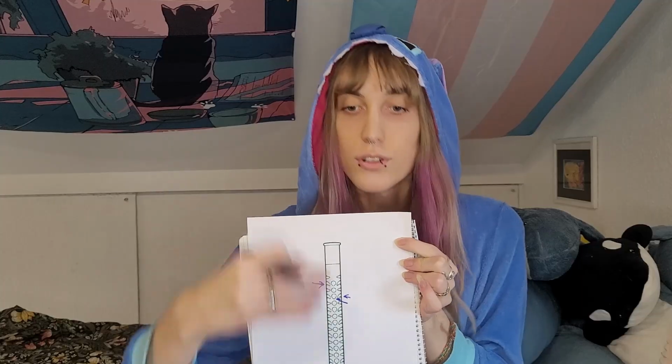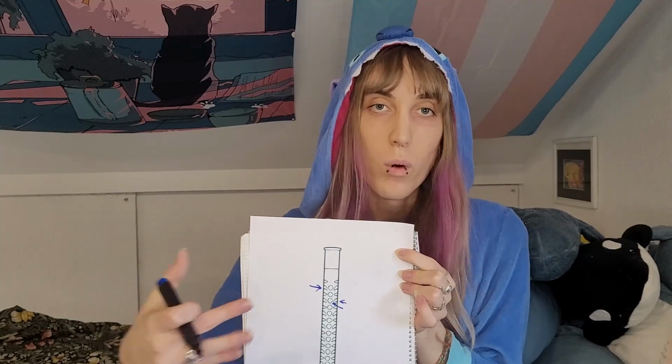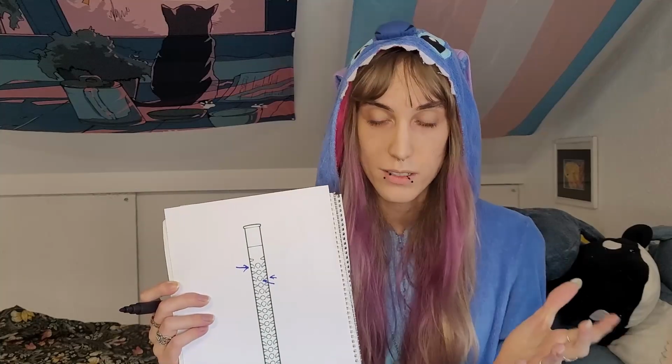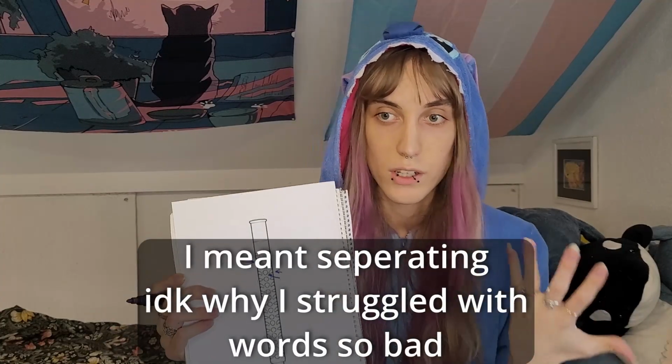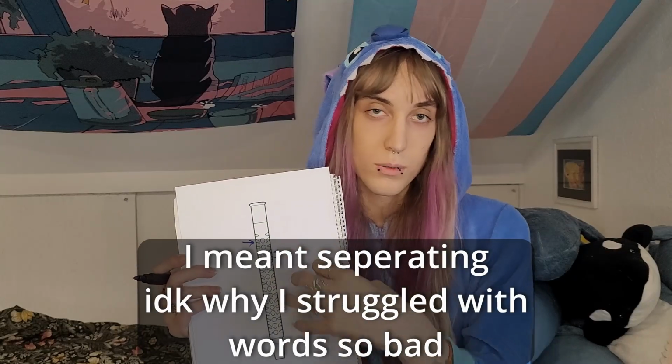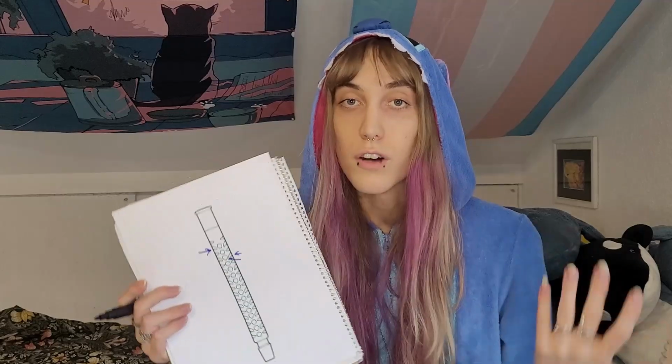So the entire mixture basically just sits there for a long while, and this improves the capability of dividing the two liquids from each other, since the one with the higher boiling point, which gets carried up, will also condense again and drop back down, and the other one will slowly rise up through the entire column into your bridge and then finally land in the product flask. That's how it works. And there are different columns, all with different ways of working.